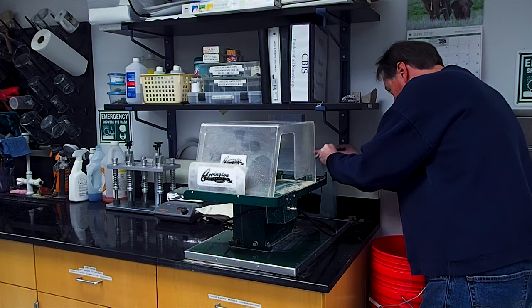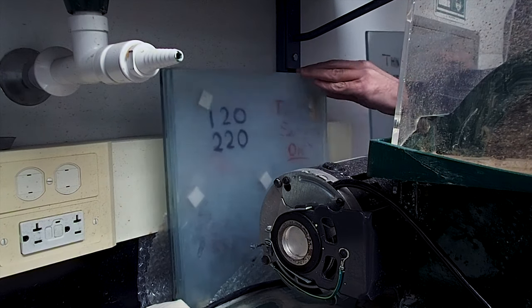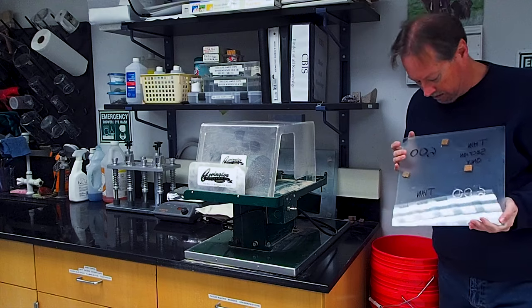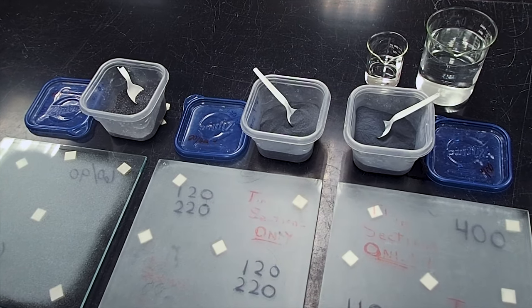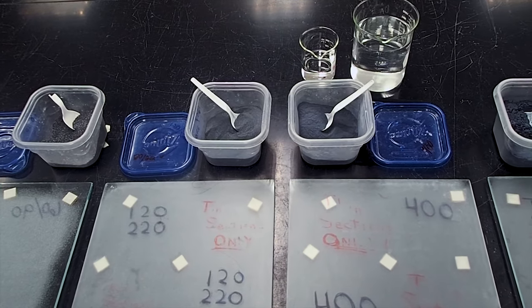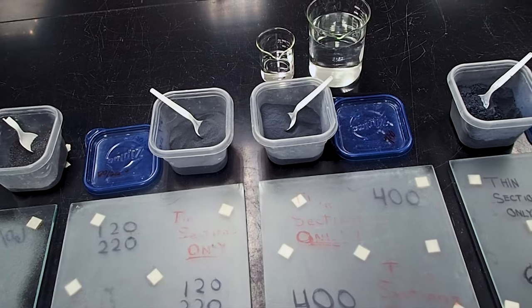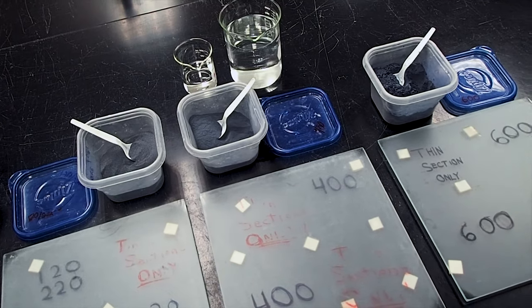Accompanying each grit, you will need tempered glass plates that will be dedicated exclusively to each grit size. To avoid confusion, we label the grit size on the underside of each plate with a Sharpie. Once you have used a particular grit size on a glass plate for the first time, that should be the only grit size used on that plate going forward. Do not use different grit sizes on the same plate.